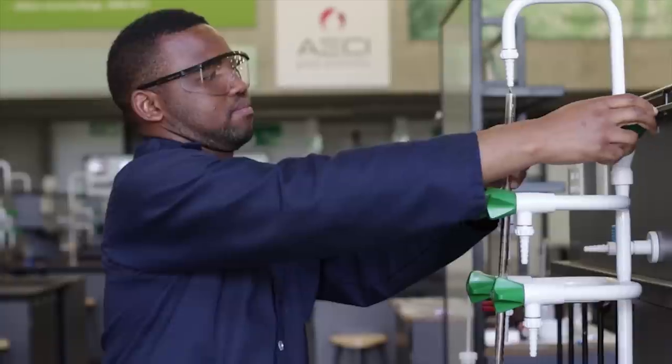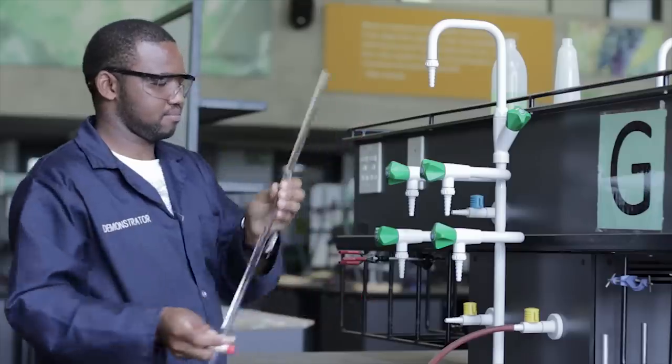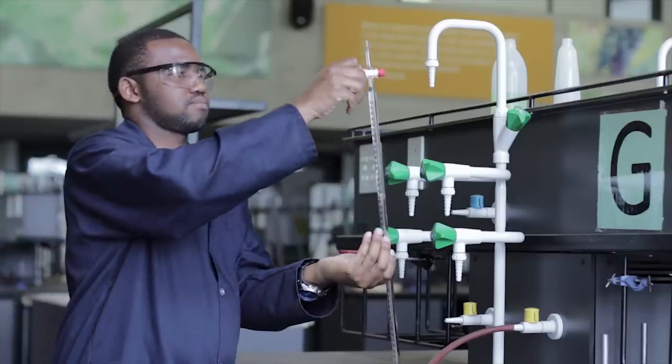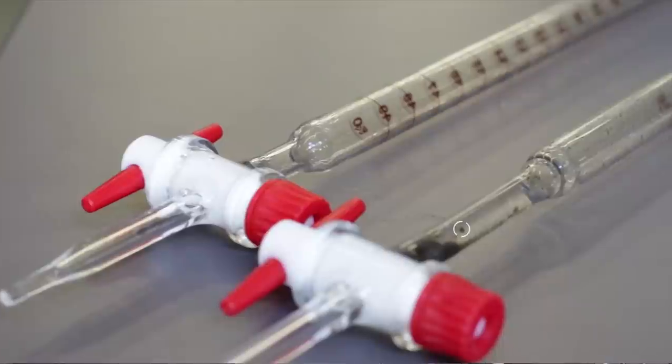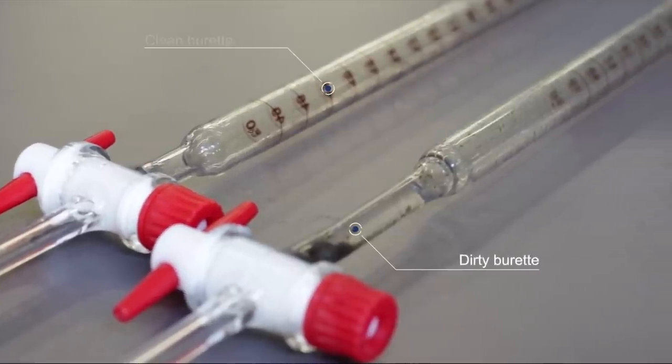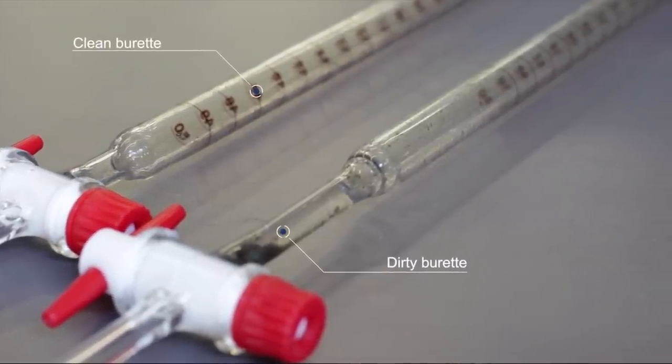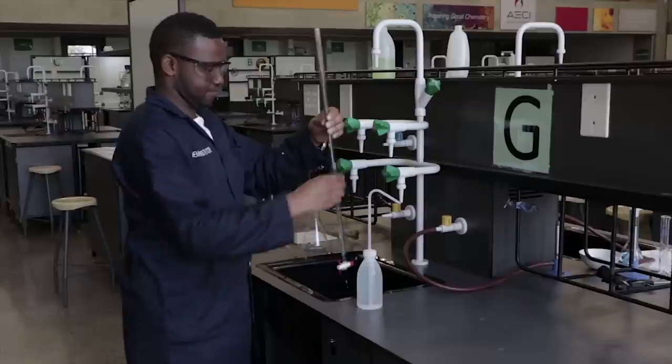The burette is then rinsed thoroughly five to six times with tap water, making sure the burette tap is open. The burette is considered clean when no water droplets stick to the inner surface of the burette.